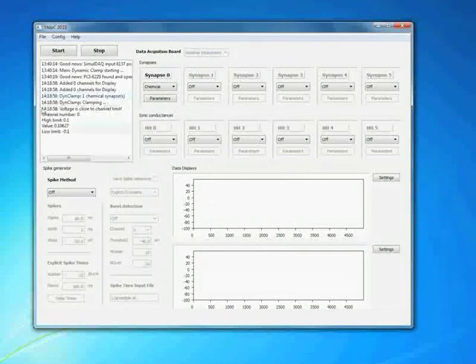And here we see a little warning, which is typical if we reach voltages that are close to the maximum voltage that can be acquired. We get these high and low channel limits warnings, and that's something that needs to be heeded. If this appears in your experiment, you probably have to readjust the acquisition range on your channels.